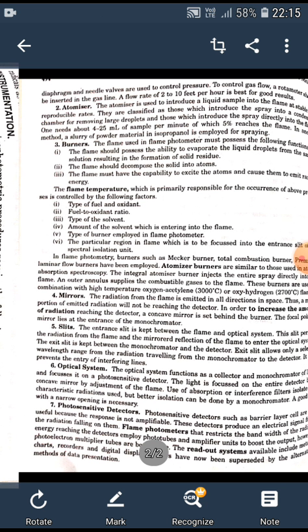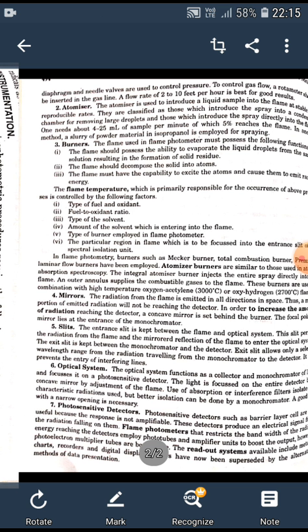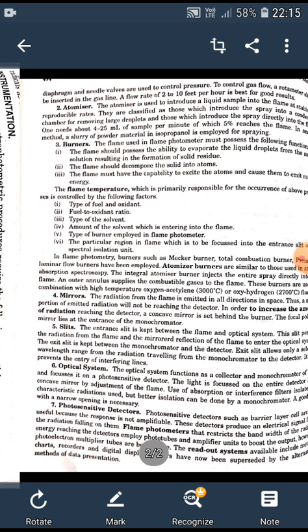In the double beam flame spectrometers, a second light path is employed for the light emitted by the internal standard element, which is added to each test solution and calibration standard. The signal of one detector opposes that of the other through a suitable indicating device to provide a ratio method of comparing the light intensities between the internal standard and analysis elements.